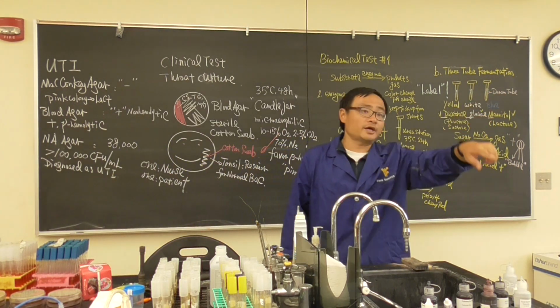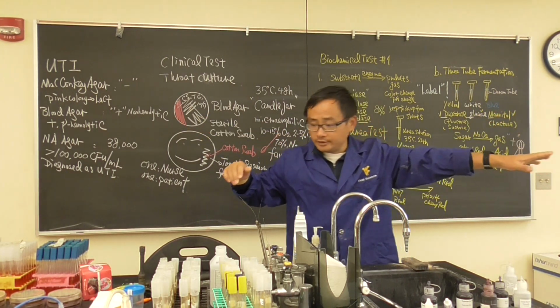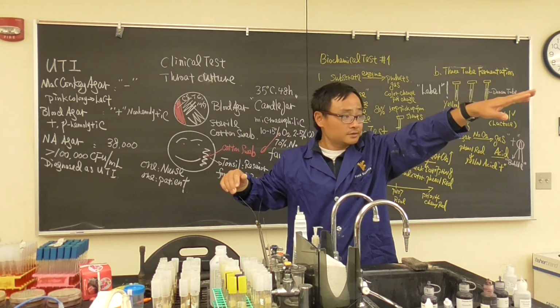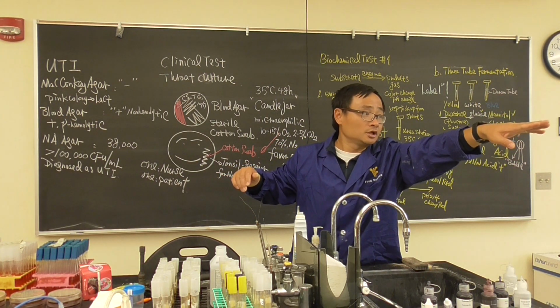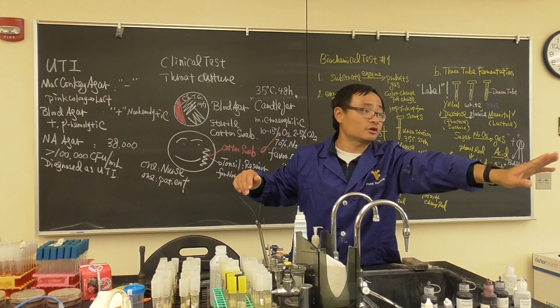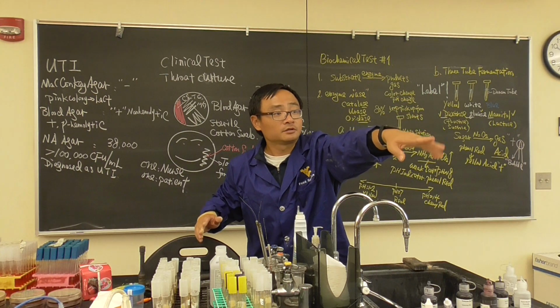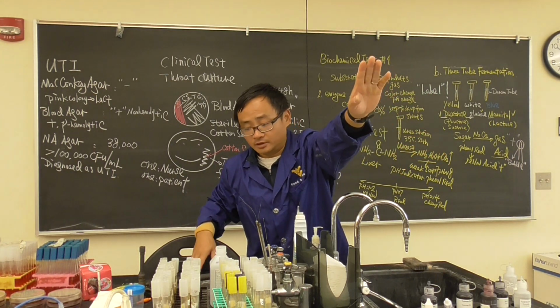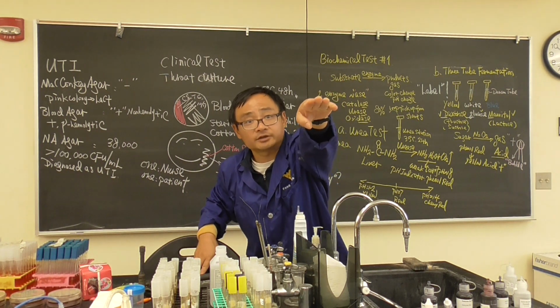Okay, next, let's assign the culture. From the beginning to the end, every bench: E. coli, Bacillus, Citrobacter, and Lactobacillus. Lactobacillus might be Staphylococcus aureus. We don't know. We'll see. From here, E. coli, Bacillus, Lactobacillus, and Citrobacter.